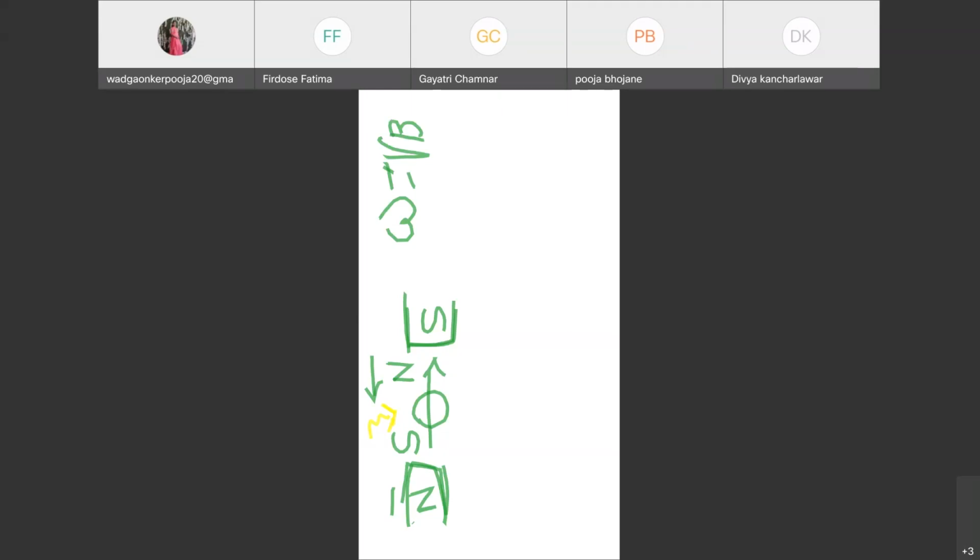What is that? That relationship is nothing but omega. Sorry, I made one mistake here. H0 it is. You see, H0 B0. See now, what is meant by this H0? H0 means applied magnetic field. Applied magnetic field or applied field which is in Gauss. ये H0 मतलब क्या, applied field. कौन सी फील्ड अप्लाई कर रहे हैं हम यहाँ पे, we are applying here magnetic field.